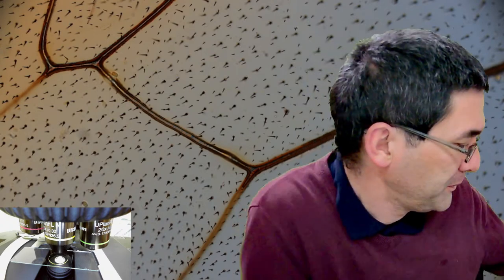Okay. I got mine from Lab Tech in England. You know what? Let me quickly do a short search. How is this called in the UK? Let me quickly find this. Brunel Microscopes in the UK. I wonder if they sell this. I'm online right now. Again, I'm not affiliated with them, but there is brunelmicroscopes.co.uk, and they sell also a lot of stains, so maybe they also sell some mounting media, chemicals and stains, slide preparation equipment. Yeah, there's a lot of hardware, solvents and reagents, acid flotation, histoclear, glycerin, formalin, insect killing fluid. They have acetic acid. Okay. Paraffin wax. I don't see a mounting medium.